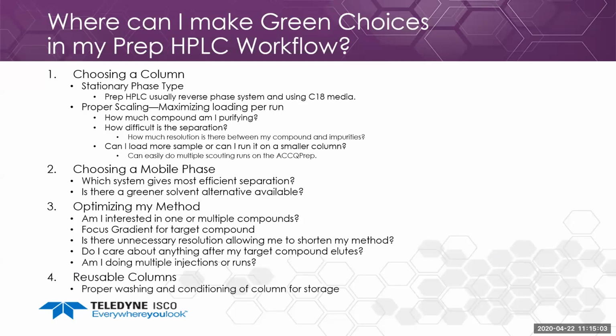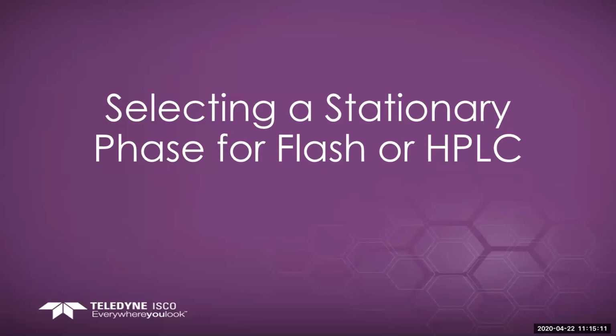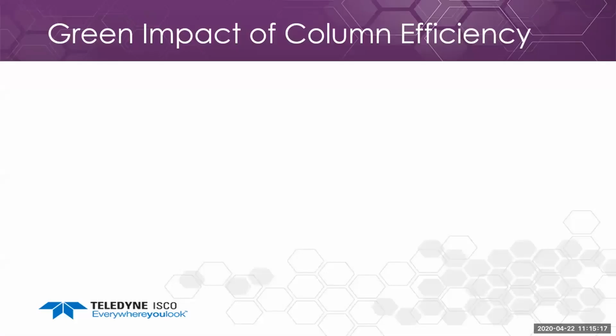And then definitely important for prep HPLC columns is proper washing and conditioning the column for storage so you don't cause any damage to that, as those are more expensive. So let's go ahead and we're going to get into selecting a stationary phase for flash or HPLC.